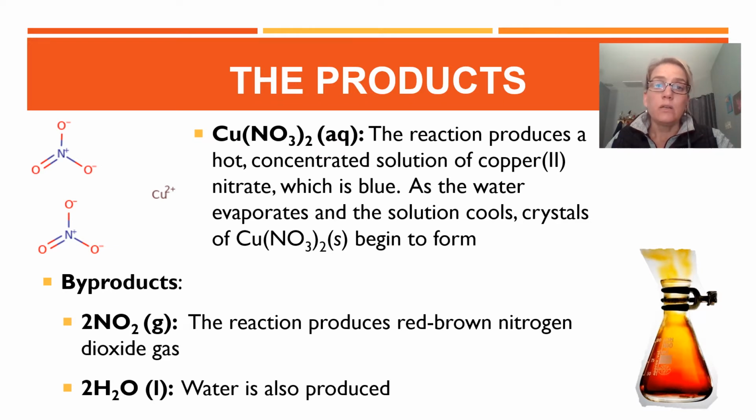Nitrogen dioxide is the reddish-brown gas that is emitted. It is a foul-smelling and poisonous gas, and if inhaled, is an irritant to humans. Interesting to note, nitrogen dioxide is also a component of smog, which is seen hovering over large cities with plenty of pollution. It is what gives pollution its brownish tint.